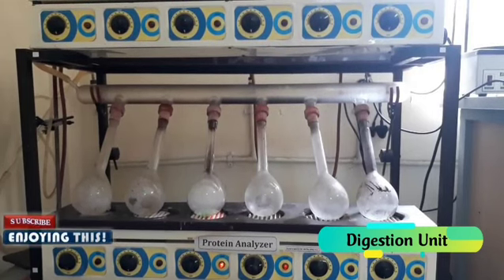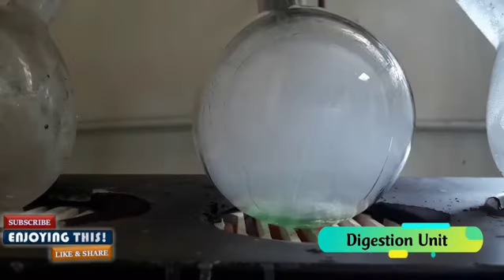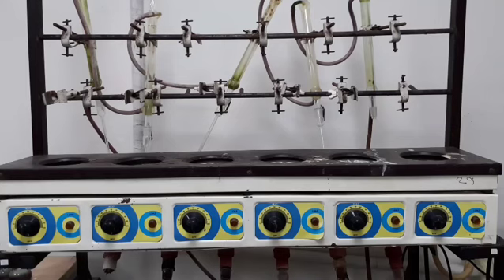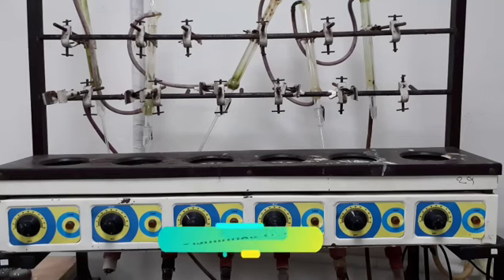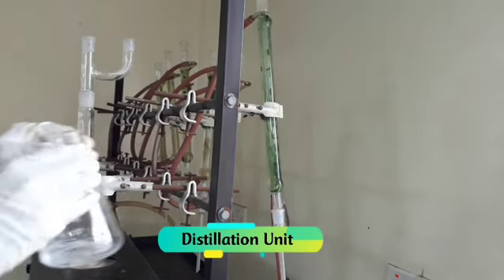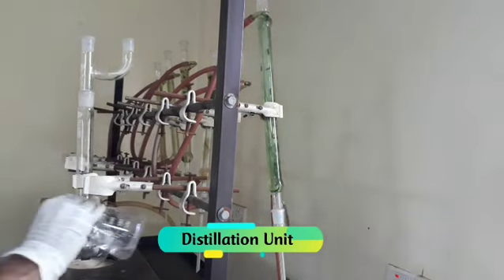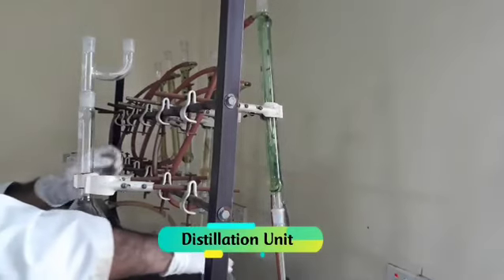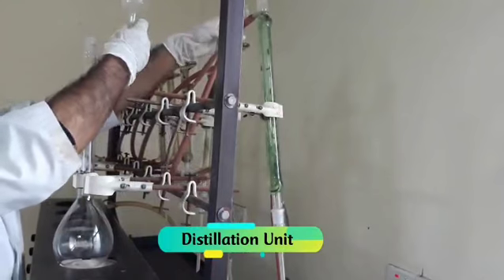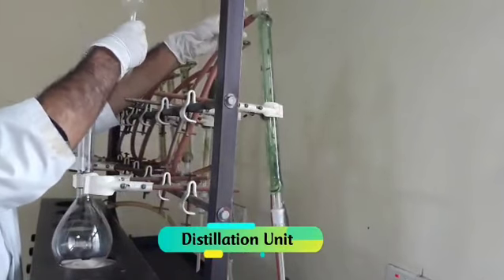In the digestion unit the food sample is placed, and the nitrogen is released and secreted into an acid. In the distillation unit it is removed and measured in the titration unit, where according to the color change the amount of nitrogen present in the food sample is measured. Modern equipment has automated sample processing and high throughput capability.